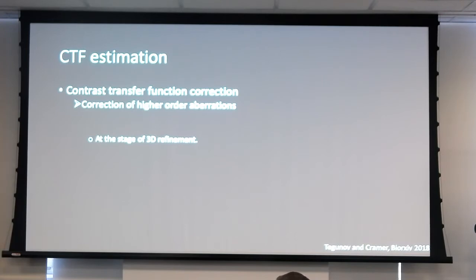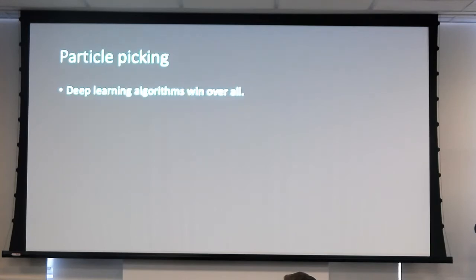All right, but before you get to that, you actually need first to pick your particles, clean up your data, and get a 3D reconstruction. So particle picking has been a big issue in the cryo field for many years. And Fred was just talking about some ways of dealing with it.